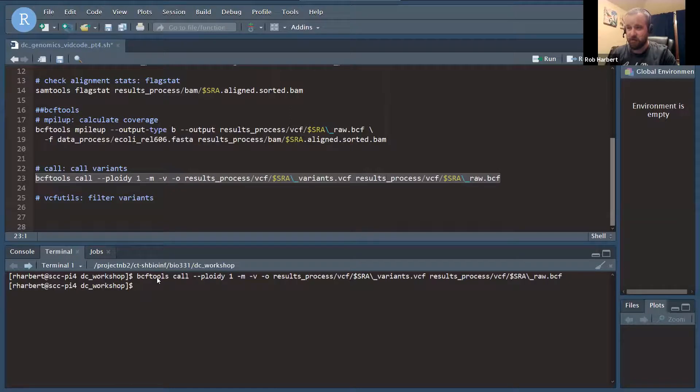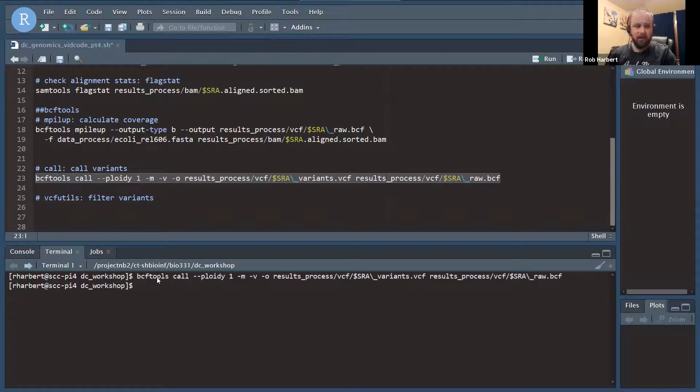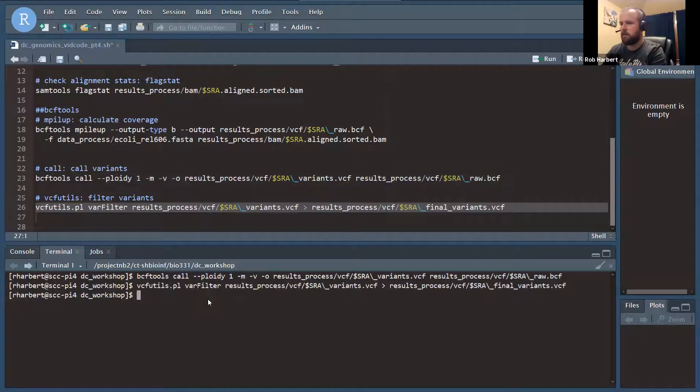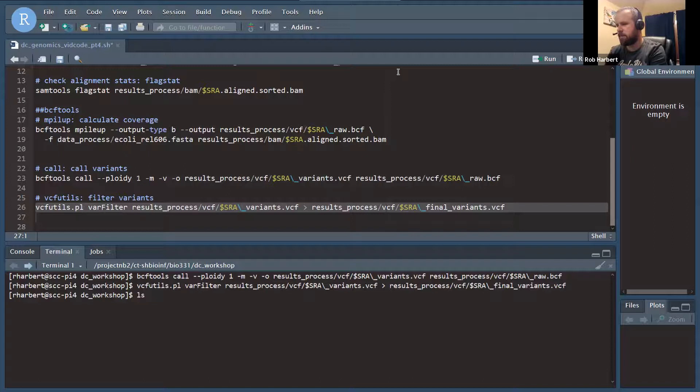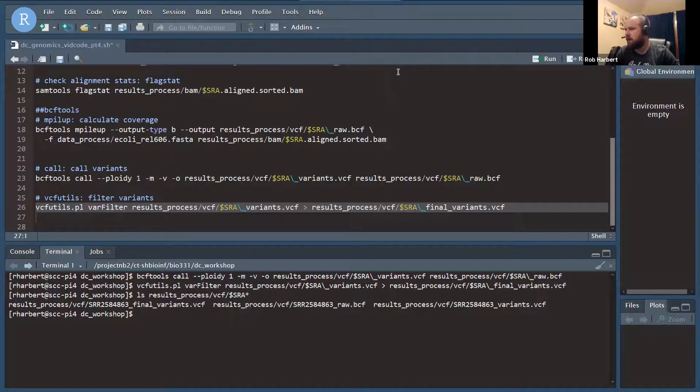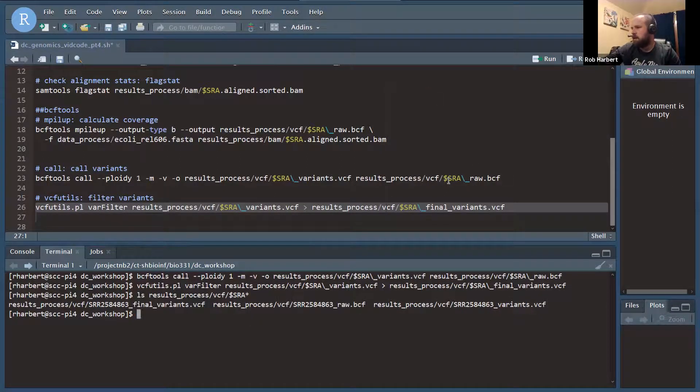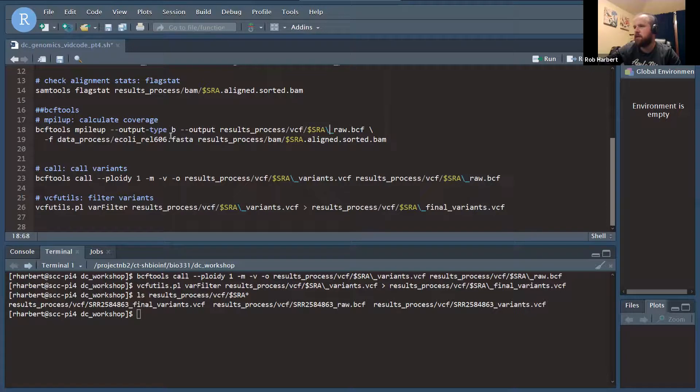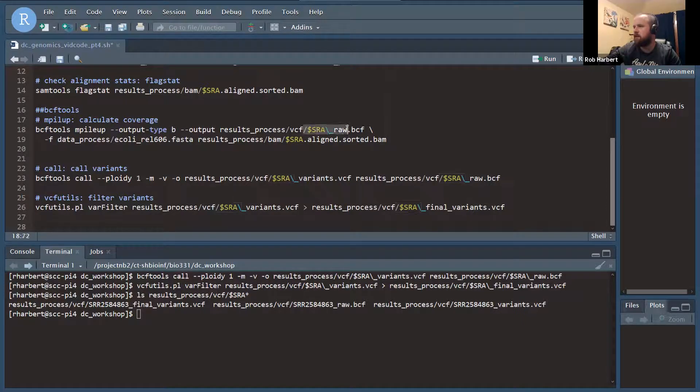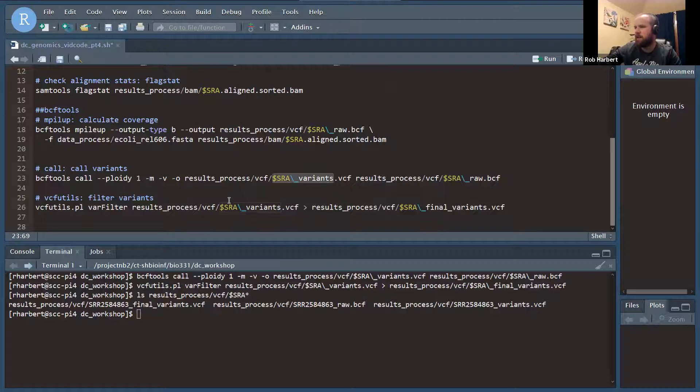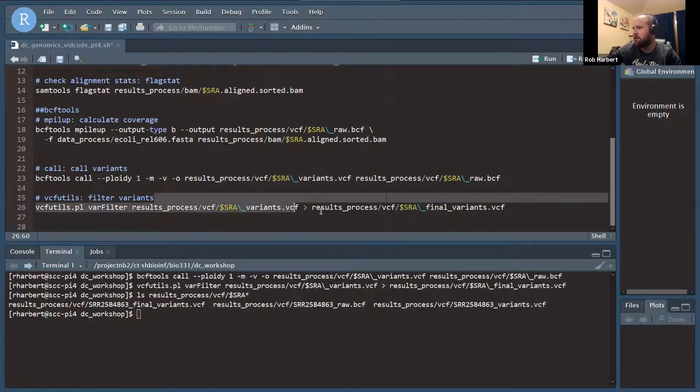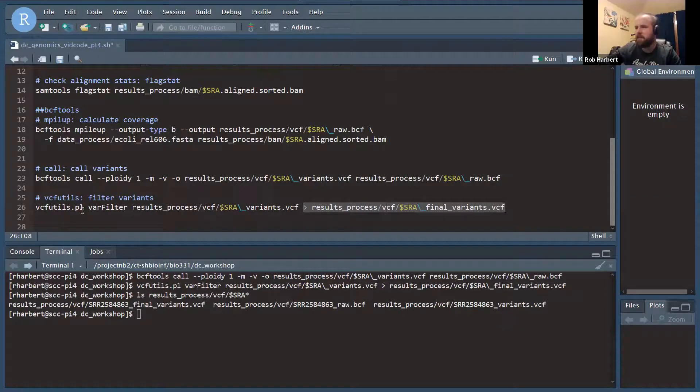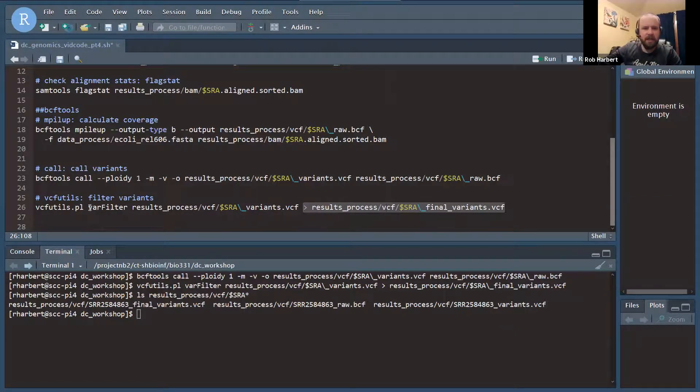Now that pileup has run, let's run BCF tools call. That's going to look at each site and make a call for the variant. That's very fast now that we're sorted and we have our pileup calculated. Last but not least, we will run the VCF utils filter. Now that gives us, in our VCF folder, a couple of different files. From mPileUp we had the SRA number underscore raw dot VCF. We converted that to SRA underscore variants dot VCF. And then after we filtered, we redirected to SRA final variants. That's going to be the one that we want to view in IGV now.